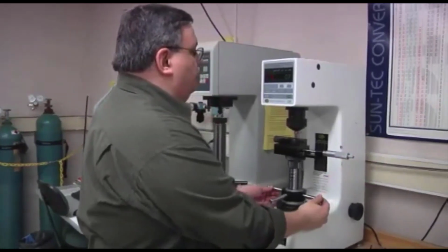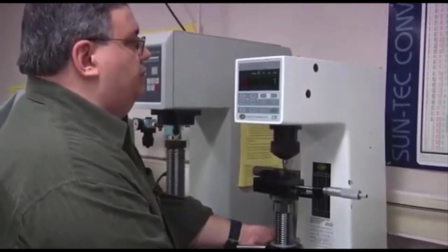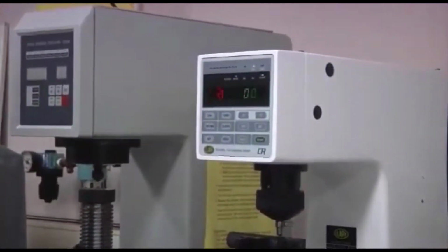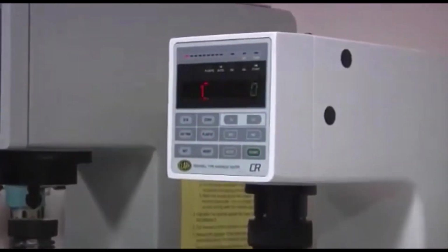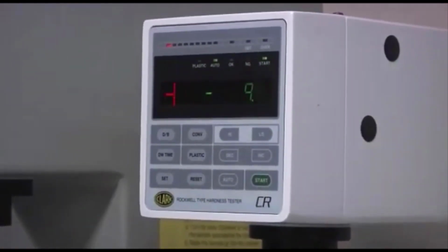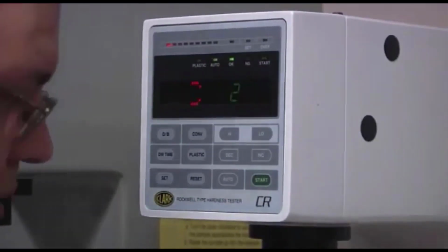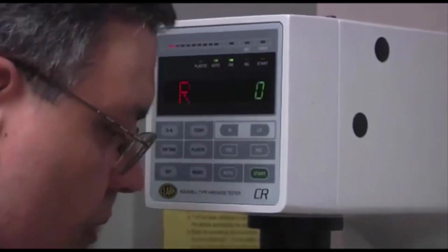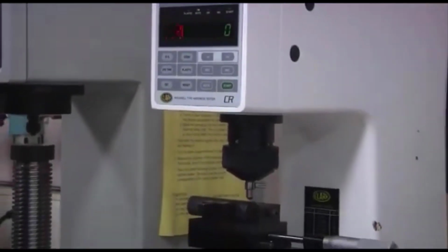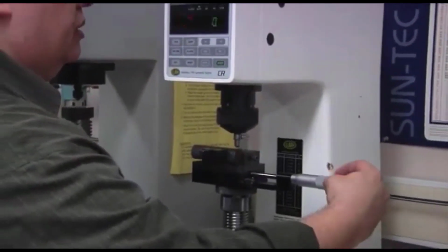And our next measurement. You can see that the 1045, the hardness drops very rapidly. Next measurement is 0.25. That is also 3 revolutions.